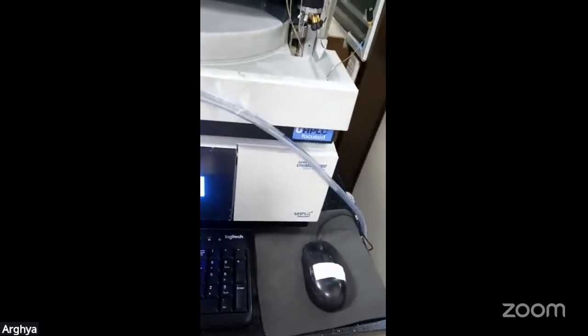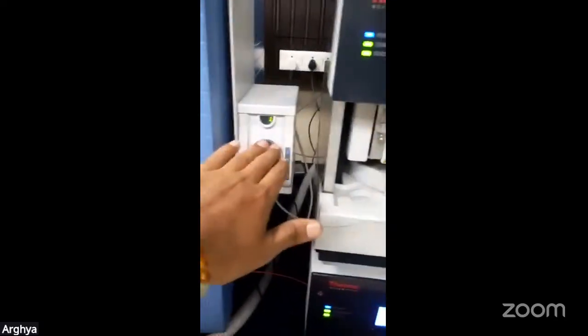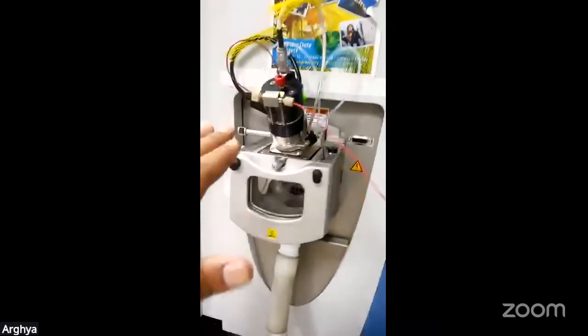So the column is placed in the column compartment. The sample is loaded. So this is the column compartment. I think maybe sometime later I can show you this. Yeah, so the samples travel from the column compartment to the main mass spec. From the main mass spec, this is the HESI probe.